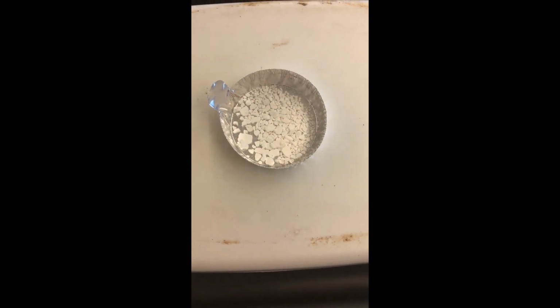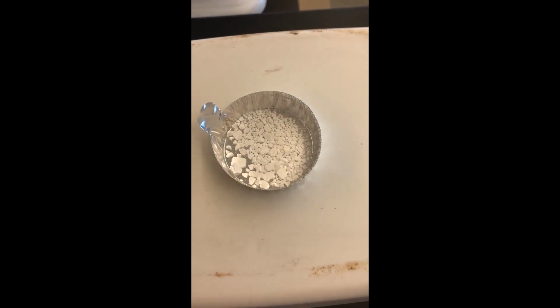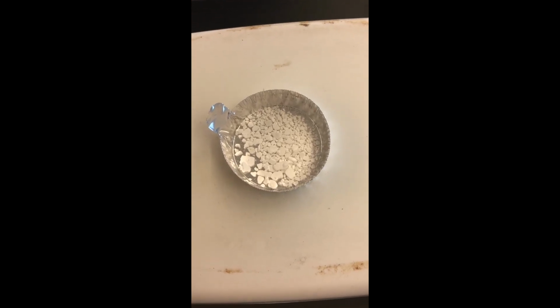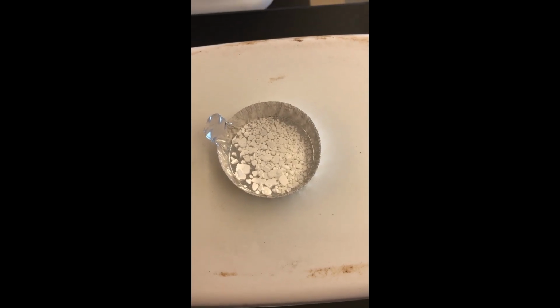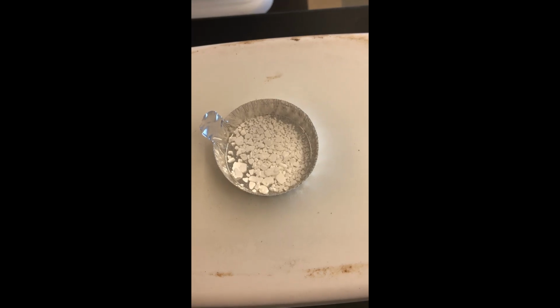You might be able to hear it sizzling a little bit. It's doing some little popping stuff. It is not melting though. And it definitely smells like something's burning.